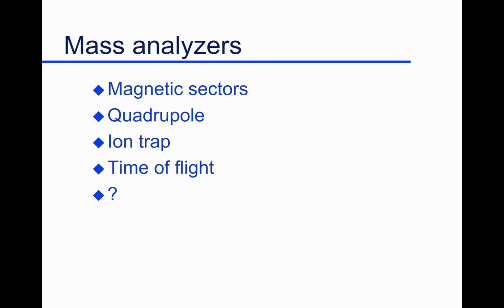You need to either take the analyte intact and put a positive charge on it so you can drag it along and see what it is, or you can hit it with high energy, blow it into pieces and look at the pieces, try and put them together. Depends on what your purpose is. Many different ways. But our first step, yep, that's our first step. We're going to go ahead and form ions.